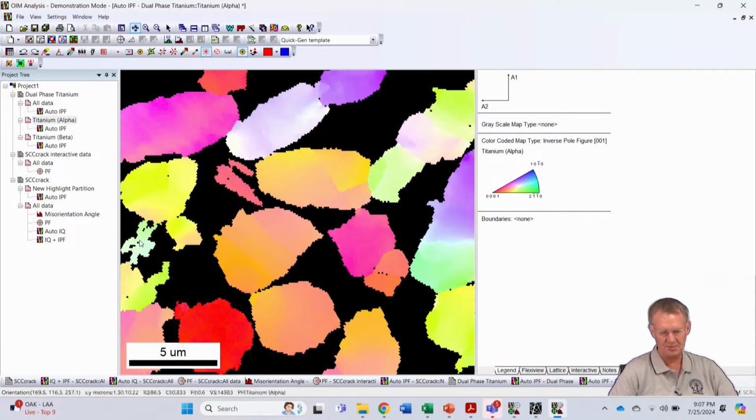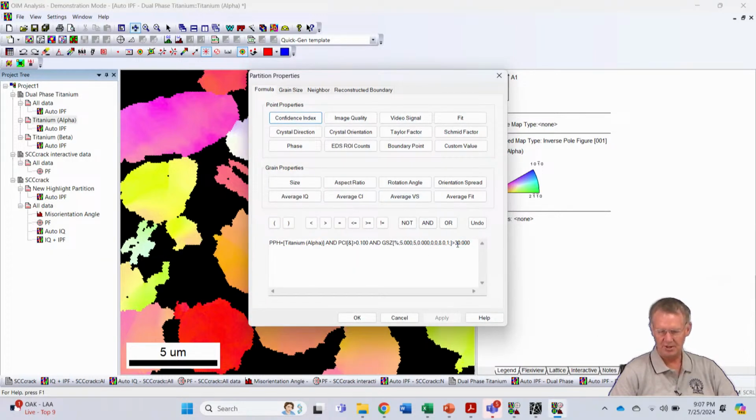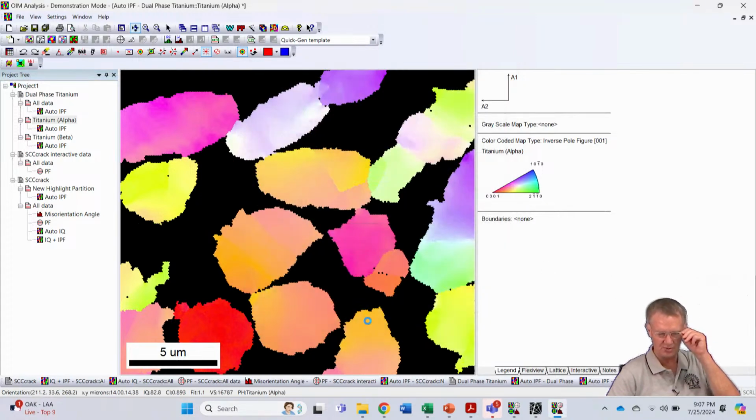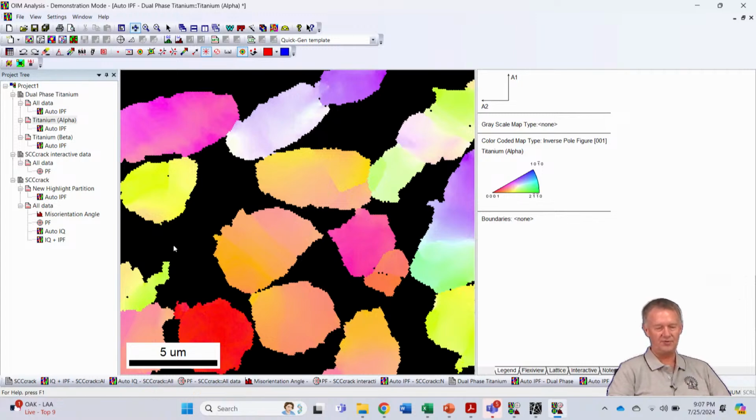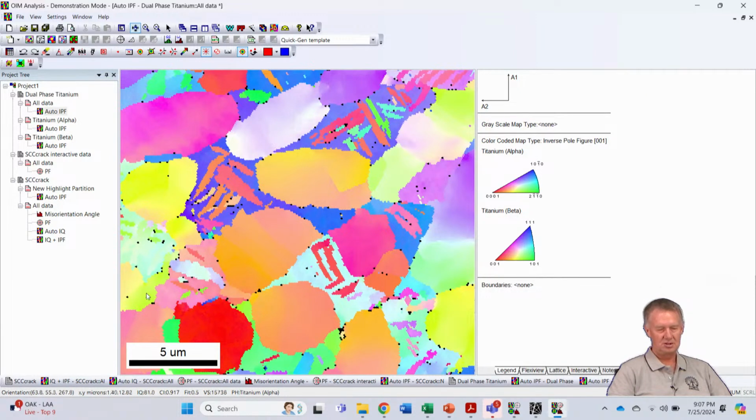Maybe these are transformation. This one I picked up, so maybe I'm going to have to either sacrifice this or include these, right? So let's go up to 40 and see what it does. But you can see the games I'm playing. That's what's important, is just to see what kind of things I'm doing here. Okay, so we were able to keep this one. We got rid of these. This one I think is maybe primary alpha. Let's see. Yeah, that's kind of a tweener.